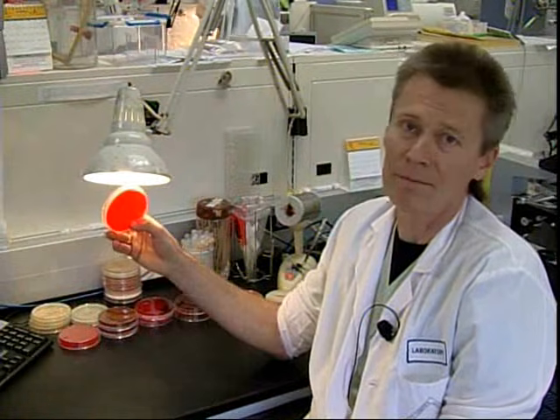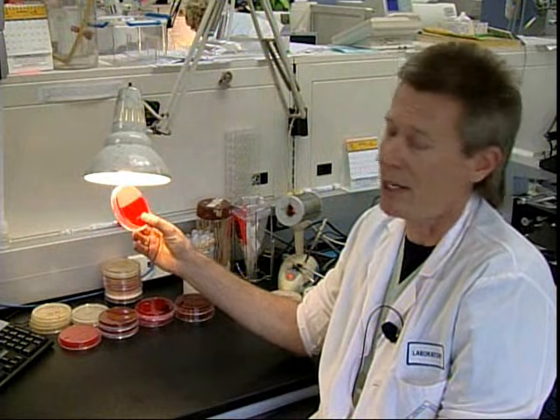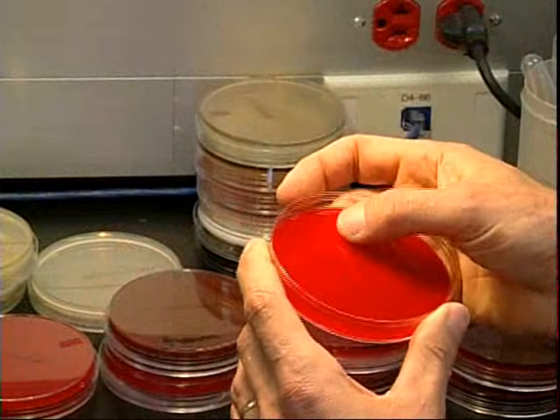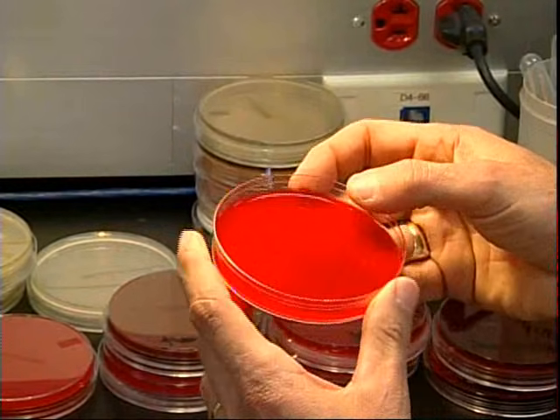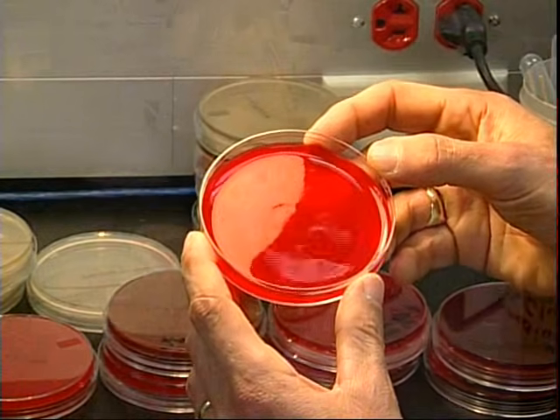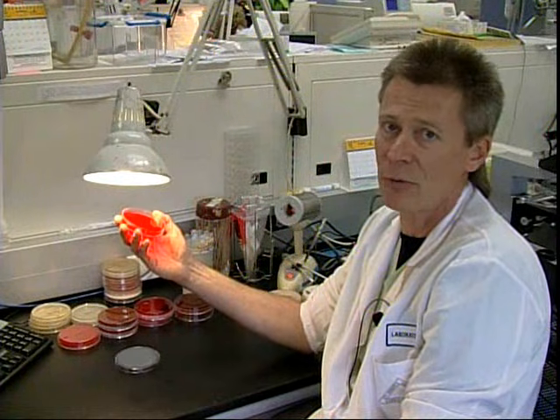To satisfy the nutritional requirements of bacteria, we use agar. The most common agar plate we use is sheep blood agar. Agar is very soft in its consistency, something like jello. You can see my fingerprints on there, and it's very moist to the touch. This agar has all the amino acids and nutritional requirements that bacteria need.